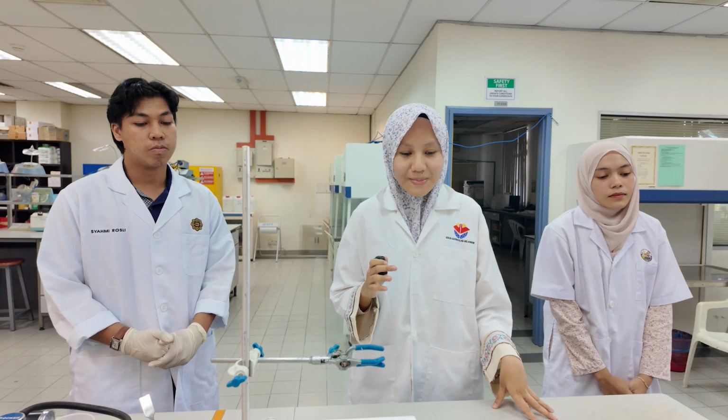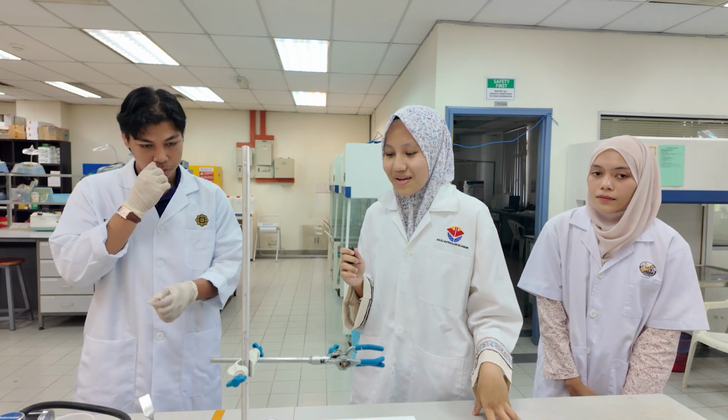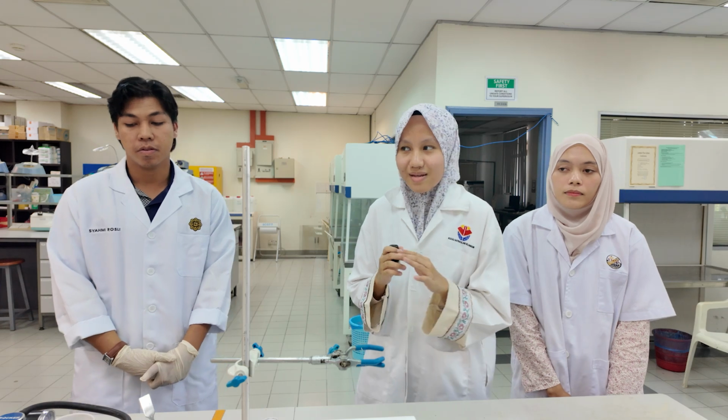When we purify the compounds, not all the compound will be recovered. This means when we are filtering, the crystal might stick on the filter paper, which can reduce the amount of crystal.